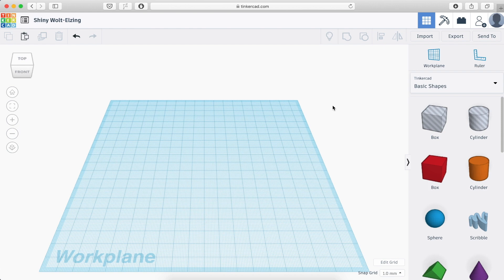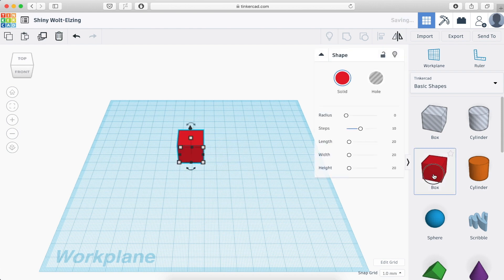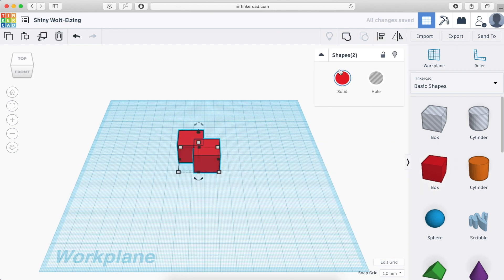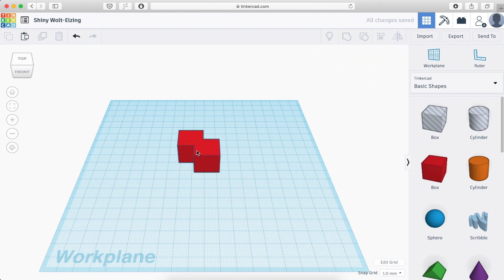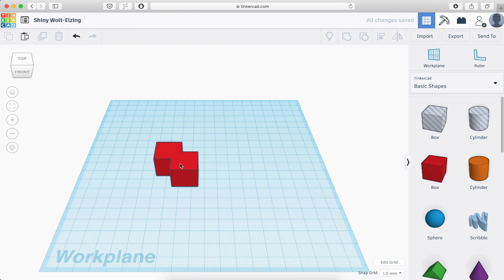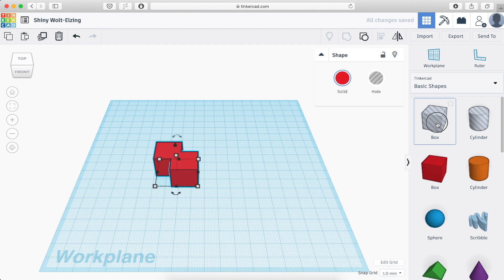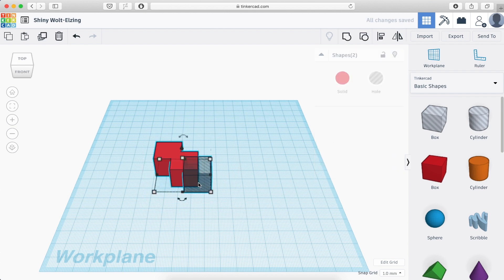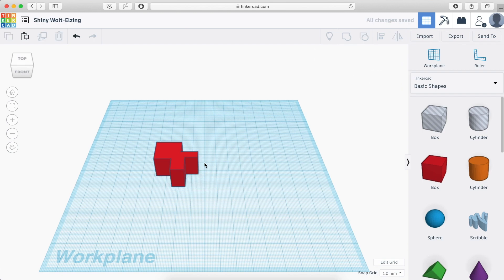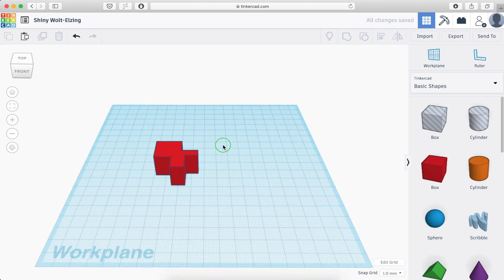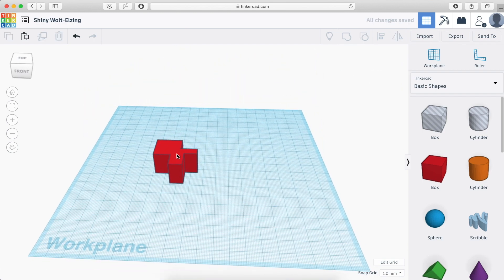There are two main things that you can do on Tinkercad. One is fusing two different solids. So if I select and I click group, this is now one solid. And the other thing I can do if I'm using a hole shape, I can subtract one from the other. So again, I'm selecting, I'm grouping them and now I removed one from the other.